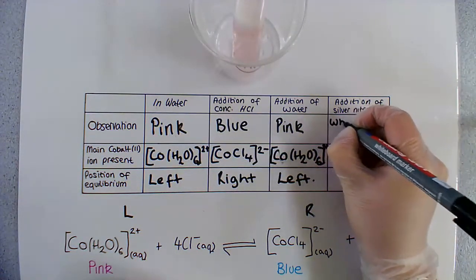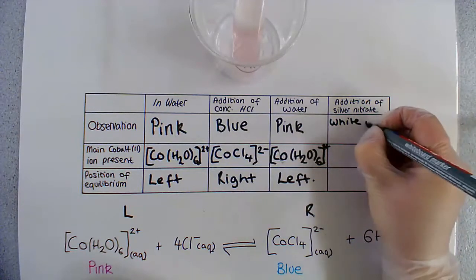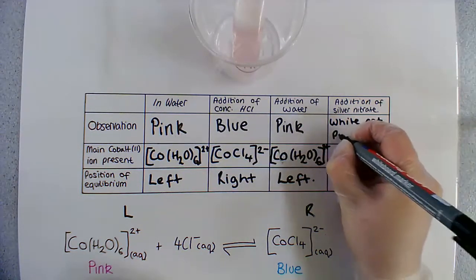So we've got a white precipitate and we've got a pink solution.